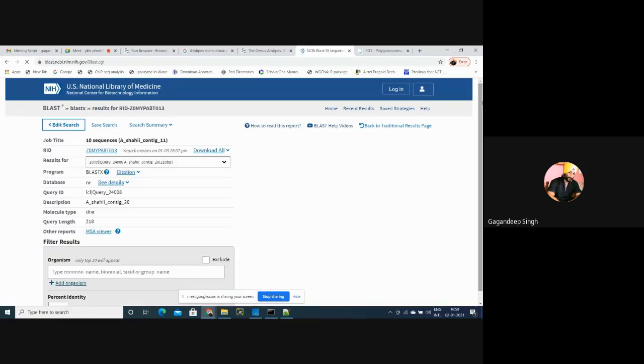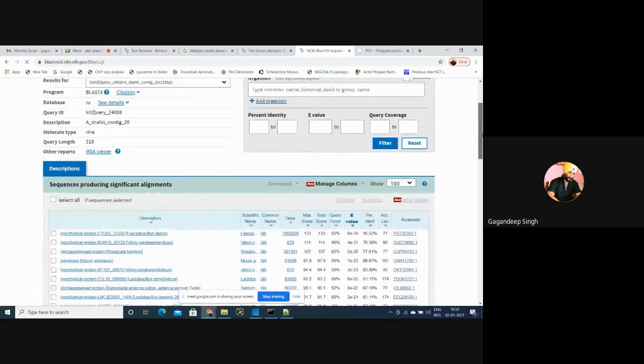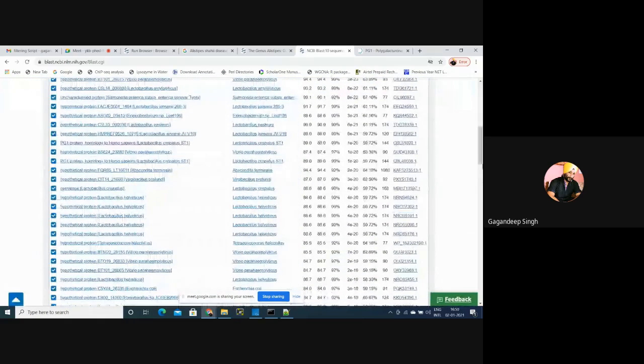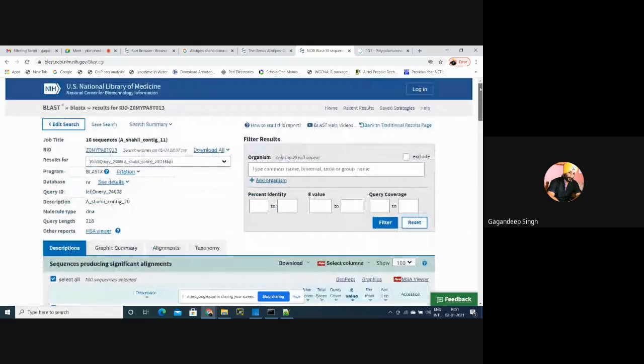Okay. In this case, no sequence has a top hit with a particular gene. But the third or fourth hit is related to some particular protein. For example, in this case, this is permease activity, maybe some enzymatic activity, I don't know. But whenever you are going to target a particular organism, you would be aware of everything, so that you can easily select a particular gene from all assembled sequences before finding its expression analysis.